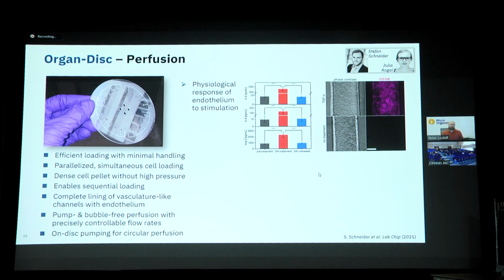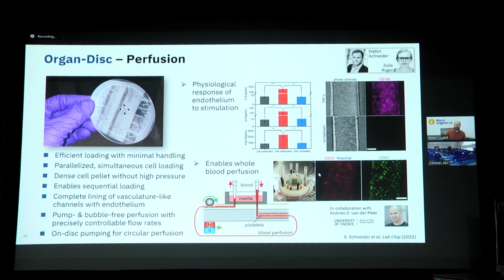and we can use this, for example, to study endothelium, but we can also use this to actually perfuse whole blood through the systems. And we did that in collaboration with Andries van der Meer, and here we studied the adhesion of platelets into the disc or on the endothelium in the disc. With that, I'm at the end.